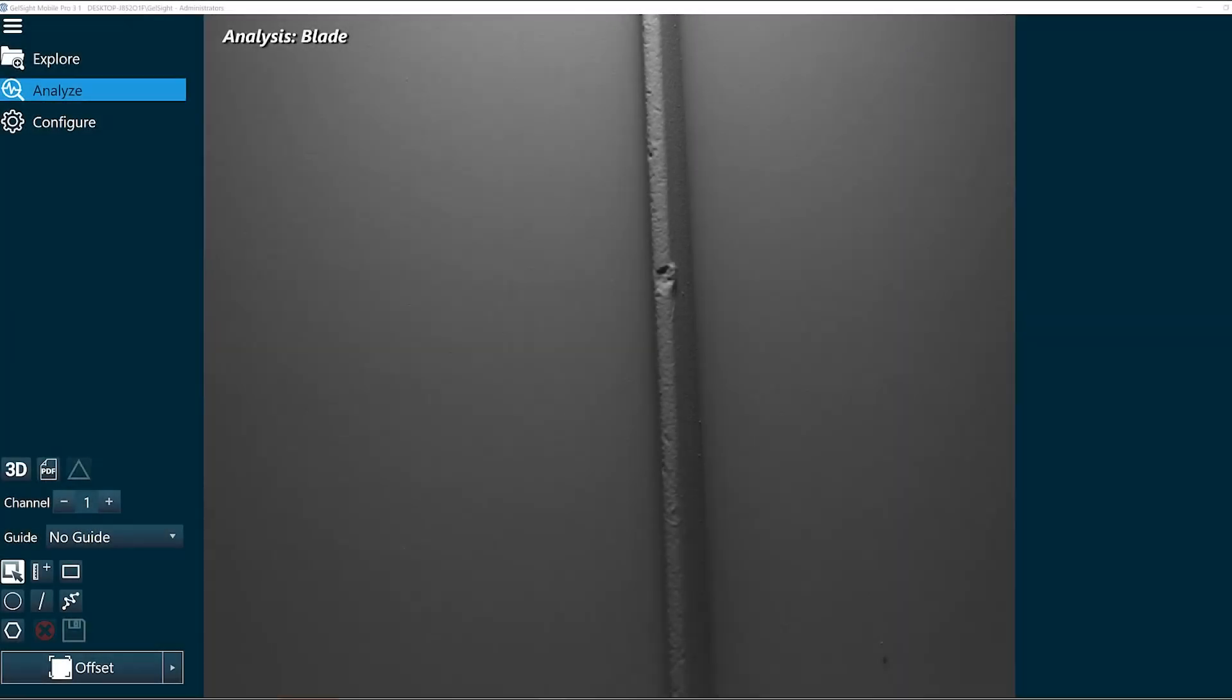In this video, we're going to review how to use the radius function. Here we have the edge of a blade. We can take a look at it in 3D.